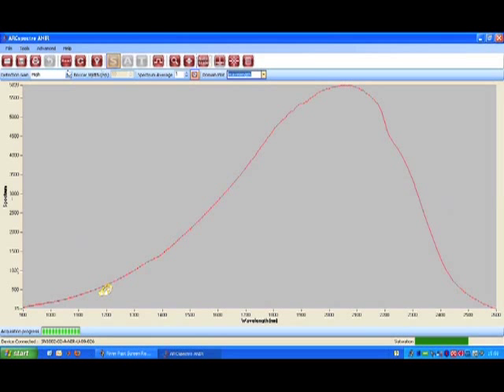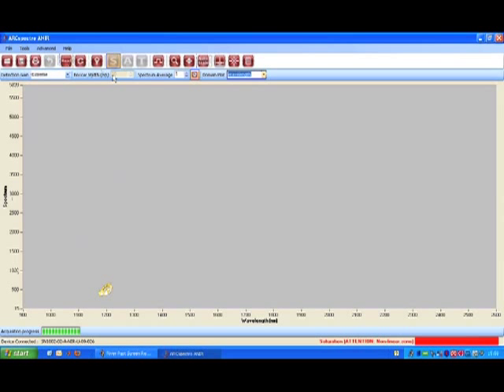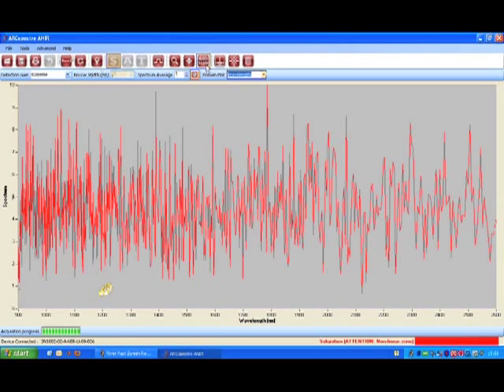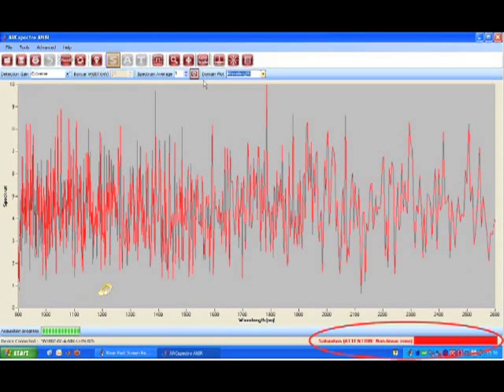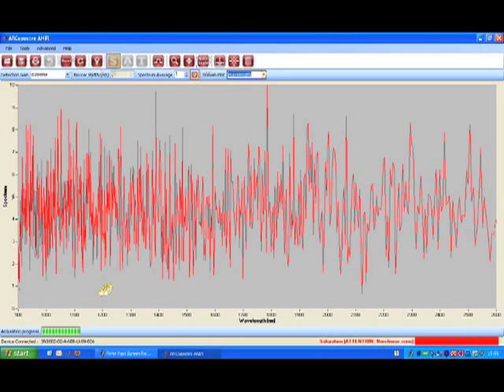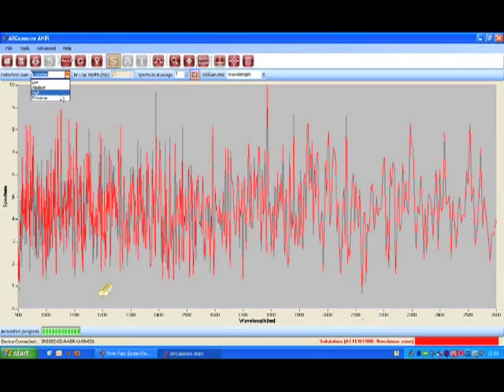However, let's turn again to the extreme level and take another measurement just to see what happens. The detector is now saturated and the instrument cannot show any physically significant data. Let's set back the gain to high and take a measurement again.